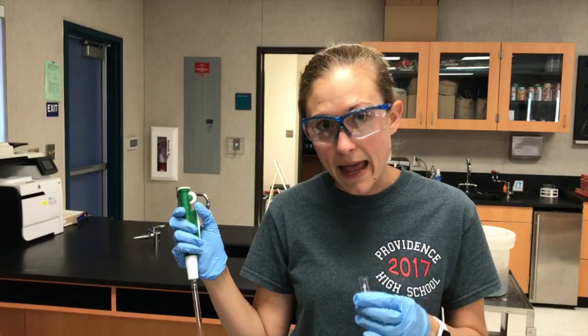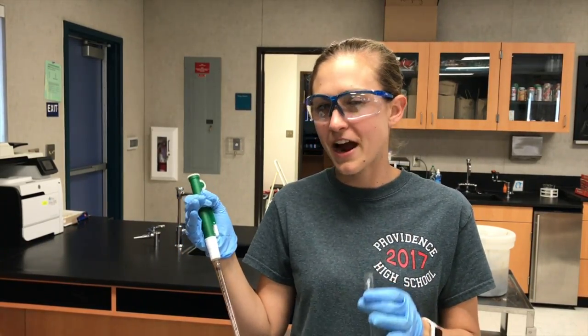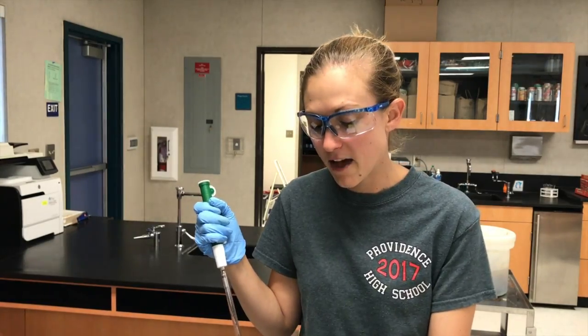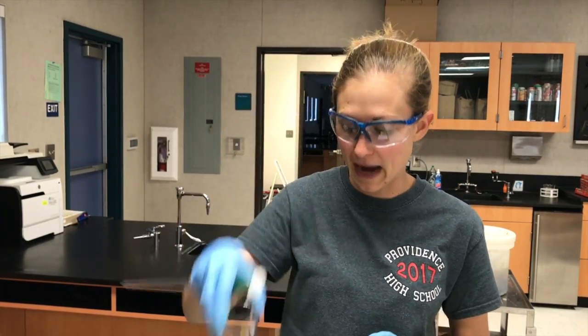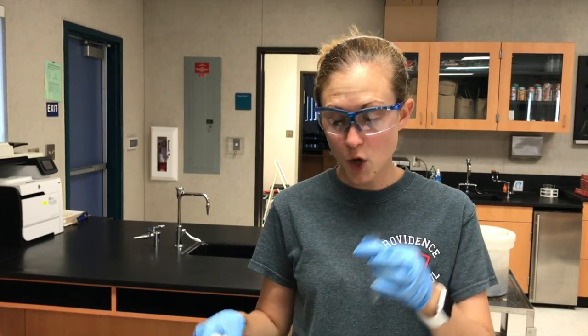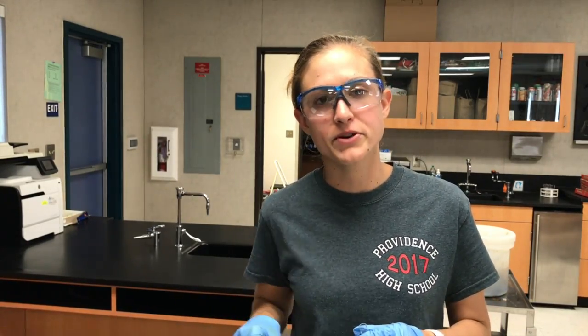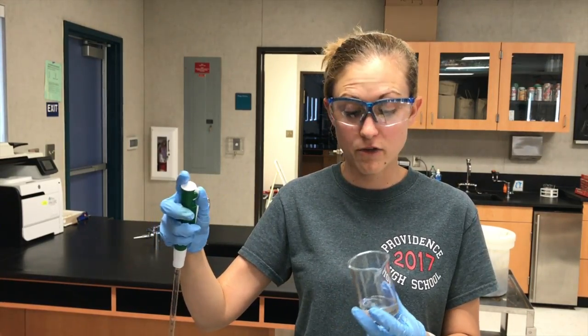So since I want 8 mils of solution, I'm going to take, and you should have gotten this from your calculations, 4 mils of my copper nitrate, and then I'm going to take 4 mils of water. Now, what I normally do is I fill all of the cuvettes with the proper amount of water for each of them, and then I fill them with copper nitrate because that prevents you from actually contaminating any of your substances. So I need 4 mils of water.